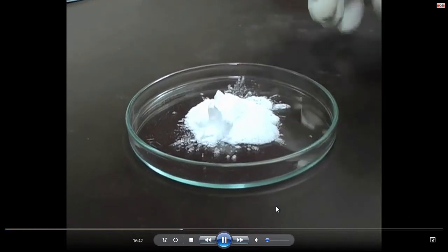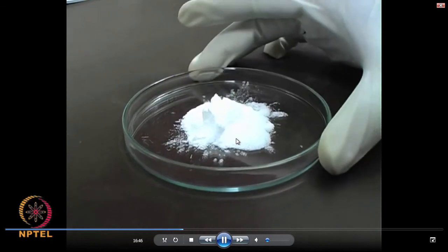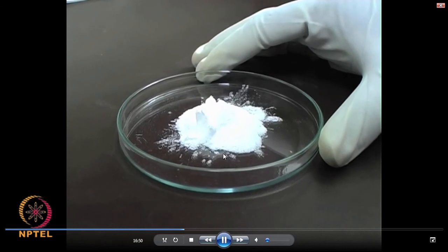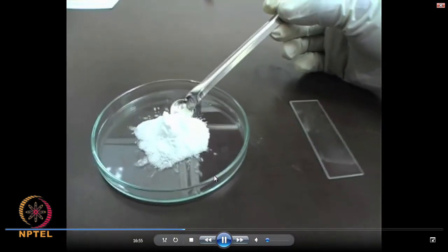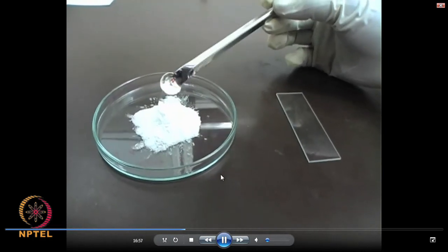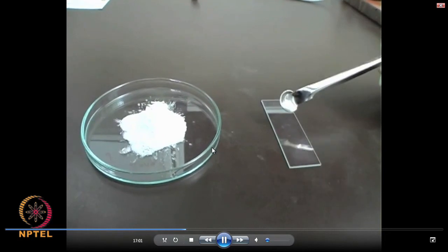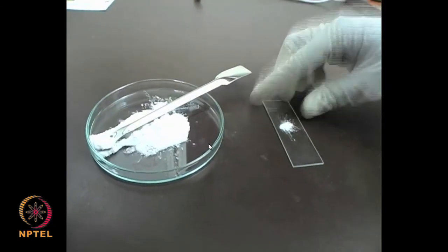What you are seeing is a powder specimen, and these are all glass microspheres. Let us look at these glass microspheres in a transmission optical microscope, like I described in the last class.